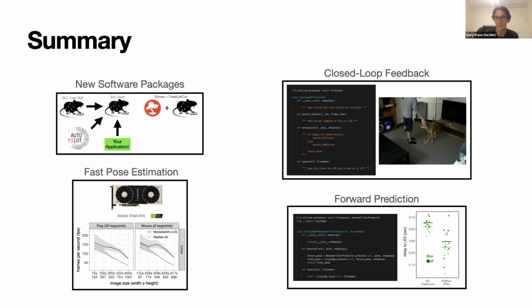And that's always going to be the case: you always label the body parts for exactly what they are. It's even possible to train one DeepLabCut network on multiple camera views. Because it's just taking the raw image and spitting out labels based off what it has learned from that raw image, it doesn't even necessarily have to be the same camera view.